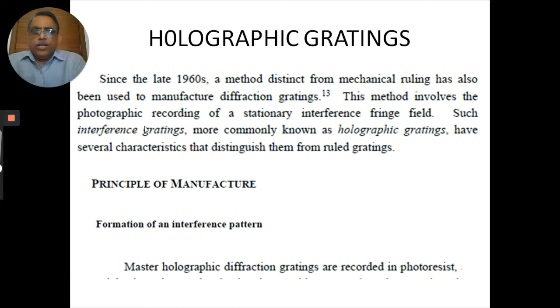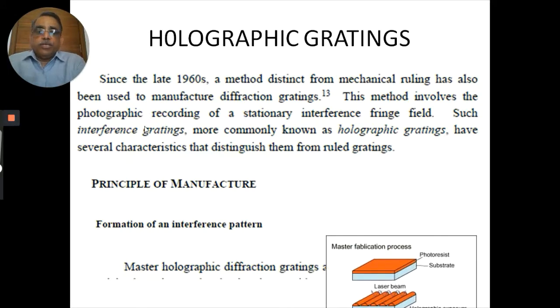And they always make a master of the holographic pattern, and then they make copies out of it. It is something like, in olden days, the printing action. Even now they make screen printing like this, or you can have letterpress printing, right? They make a master, and then from the master you make the holographic printing of your grating itself. So this is how they were really making the grating.